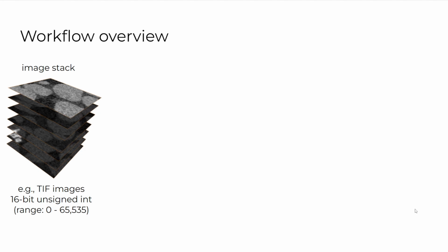The starting point of our workflow is the input data, which in our case is an image stack, as you can see here. In an image stack, each image corresponds to a slice of a 3D object or sample that you would like to analyze. This can be anything from a mouse brain tissue, rock sample, or in this case, a pack of sand particles. Image stacks like this are typically acquired through imaging techniques such as microscopy and tomography. This particular example here is a CT scan of a small pack of sand.